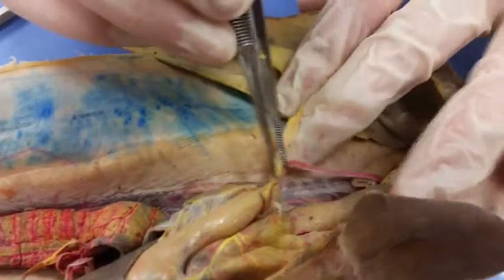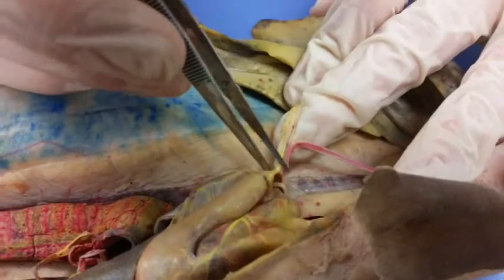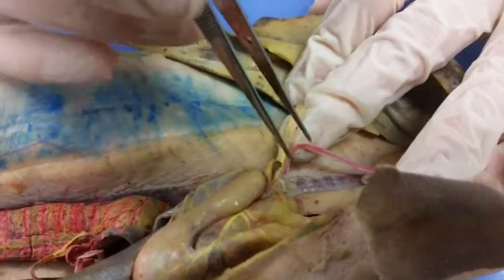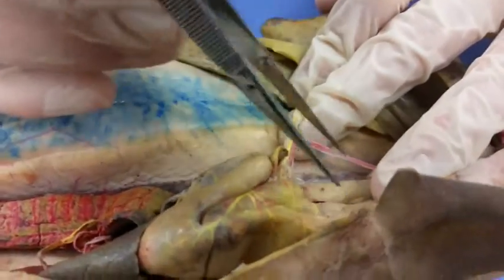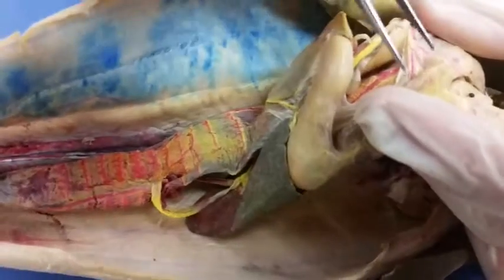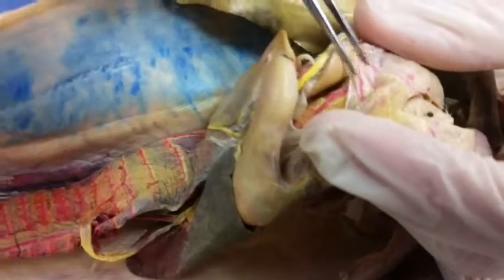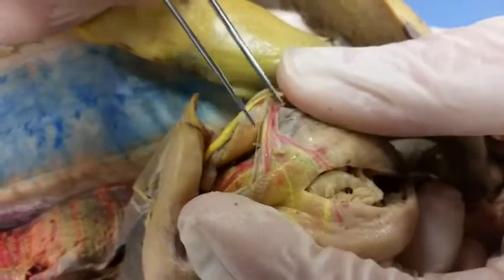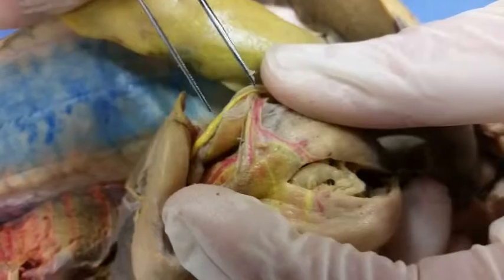When you get down here, that's going to merge into gastrohepatic artery. And eventually that's going to divert again some into hepatic artery, but also some into gastric artery, which again you can see that theme of 3 branches of the gastric artery, 3 big branches at least.